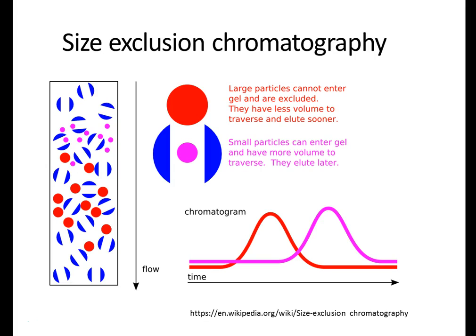Now how does size exclusion chromatography work? The gel consists of a sort of little spheres. The spheres are hollow. Small molecules such as soluble proteins can enter the spheres, and the vesicles which are large will not, so the vesicles will migrate along the spheres. So the vesicles will be in the void volume, whereas the soluble proteins will be present much longer on your column. And so they appear in different fractions and they leave the column much later than your vesicles.